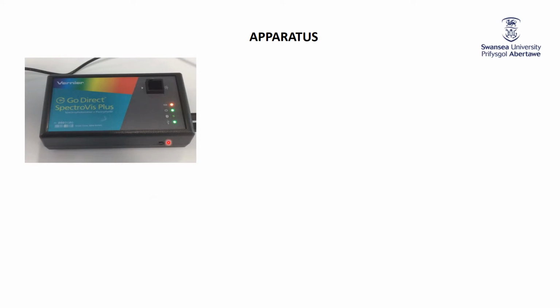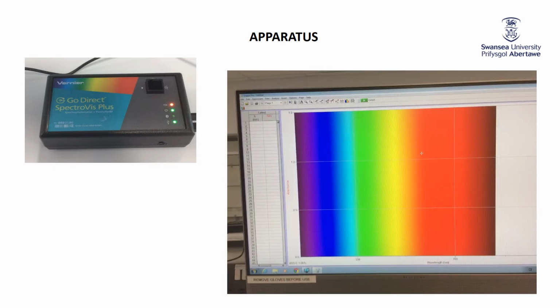If you're in the lab, you would see our spectrophotometer. It's a nice little thing there. We put our sample in a square test tube called a cuvette into that hole there, and then we beam light through it. So the light goes in there through the sample. We measure what comes out afterwards, and then we'll display the results on our computer screen.